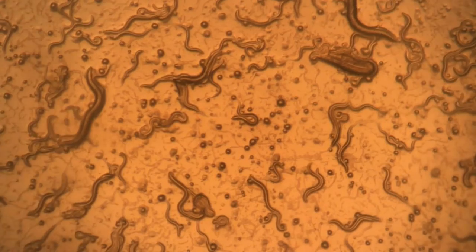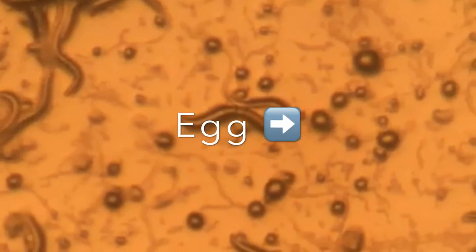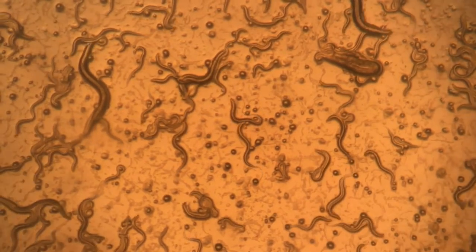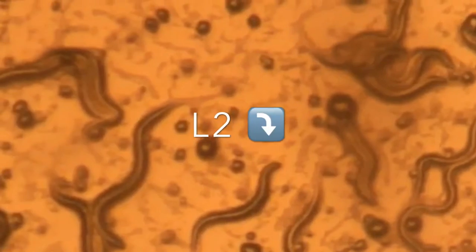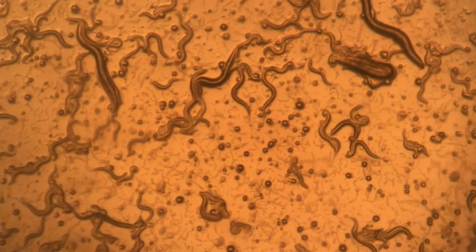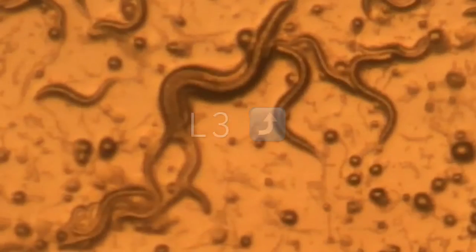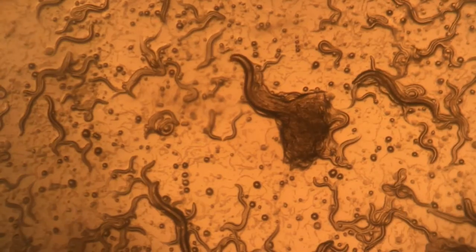Wild-type worms are characterized by an S pattern while moving. Here we see an egg. Here we see an L1 C. elegans characterized by its small size. Here is an L2 C. elegans, just slightly bigger than the L1 C. elegans. Life stages L3 and older are usually where we see mutations occur.